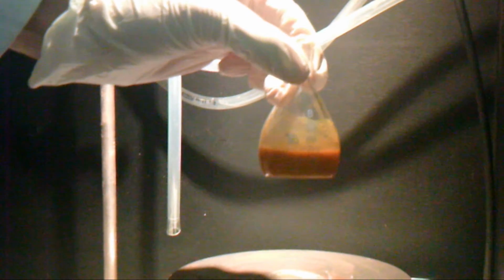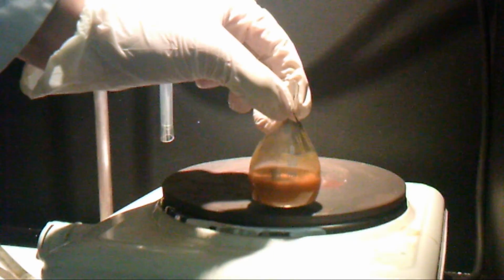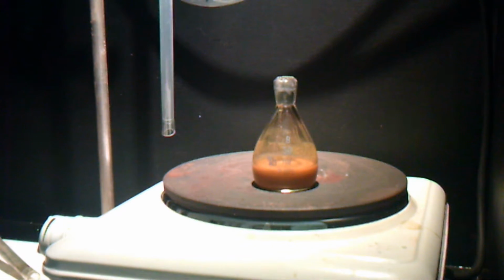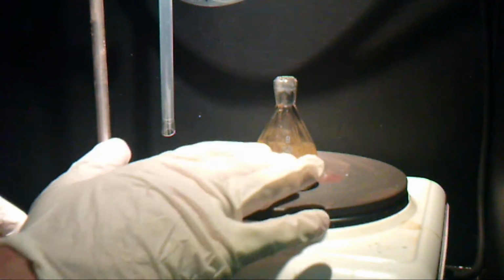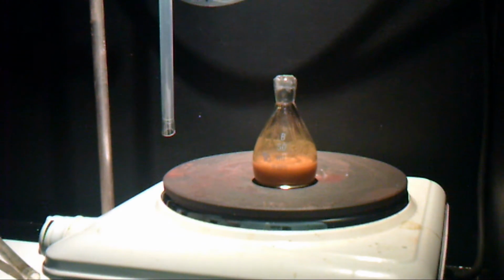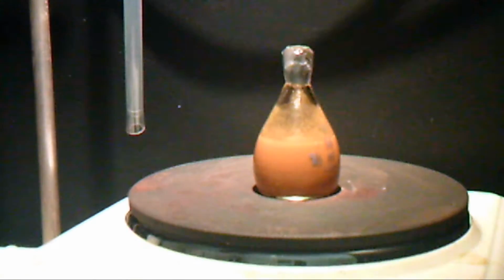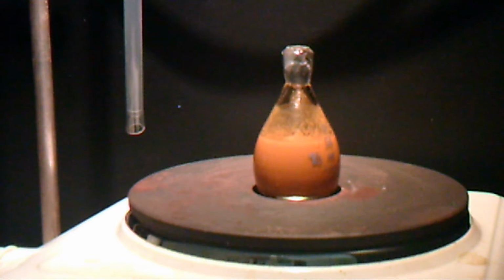Here maybe you can see better the completely different color we have now. And also I wear different gloves because some of the product fell on my hands and I had to change the gloves. So here we put some water to make the product crystallize out, and it was a success.